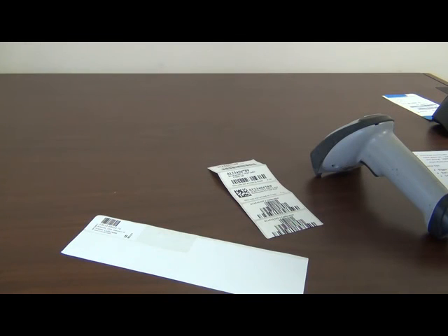If you're purchasing scanners, I think you want to test scanners in the configuration that you're going to use, like with the symbologies turned off and in the smart stand mode. Make sure that you're getting what you're shooting for.